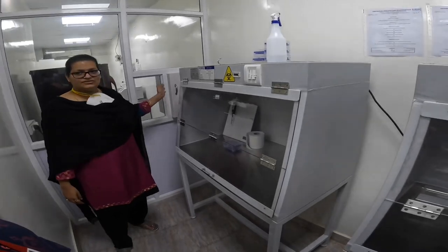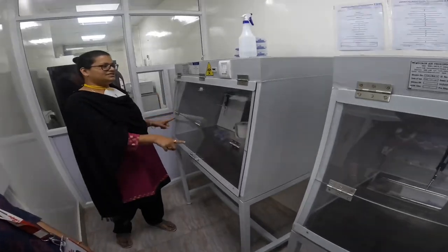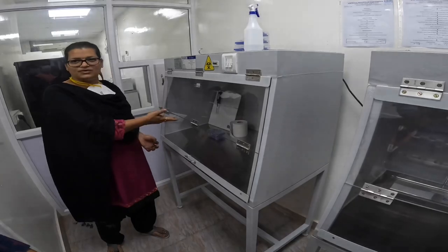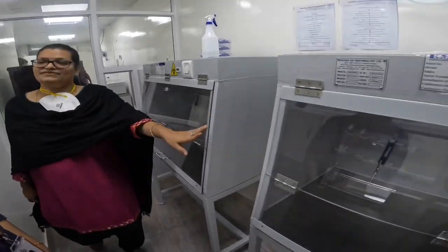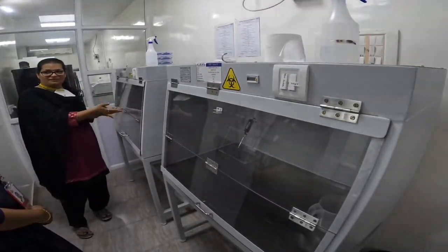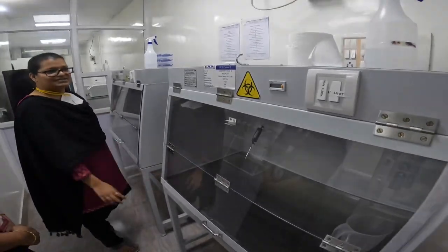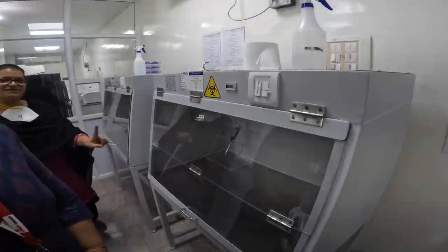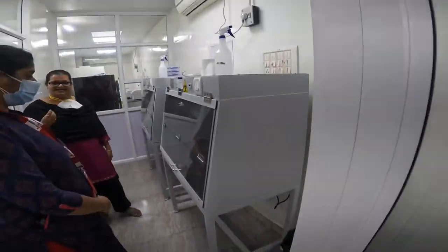This is the main room in which we prepare the main RT-PCR mixture, which goes into the PCR machine. Usually there are two chambers, that is, two workstations present in this room, and once the preparation is over here, we directly take the mixture to the PCR machine. Again, according to the NABL standard, they have installed these workstations. And she's giving some inputs on the machine. Now we are going to move on to the main PCR machine.